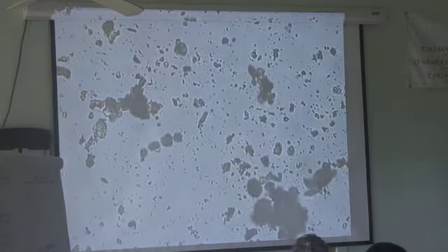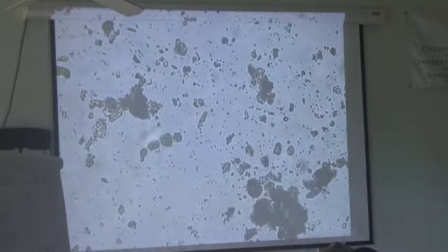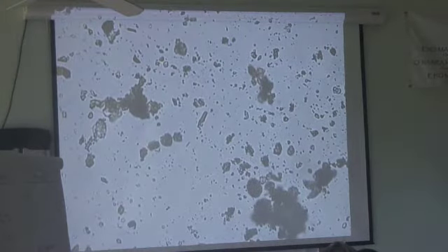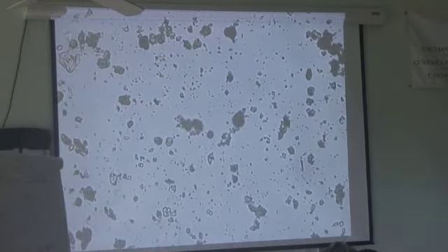So watch as I close this down and I start to shadow. Look at all the stuff that's actually in that field of view. And that has been the problem with a lot of people who say, oh no, you can't really see anything with a microscope, because they aren't using the equipment that they've got properly. You have to remember the shadow. So when you're looking at something and it seems awfully fuzzy and difficult, remember to focus your condenser and then shut down that iris diaphragm. Where is the best place? Where does it shadow best for you? A lot of times you want to just be playing with this as you start looking at things through your microscope. So play around with your iris diaphragm.